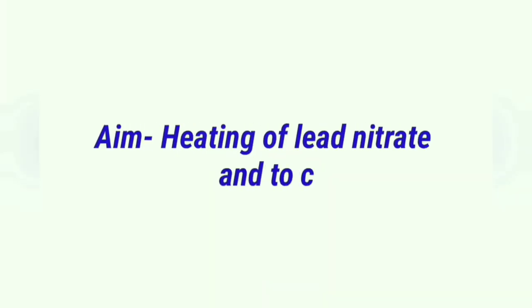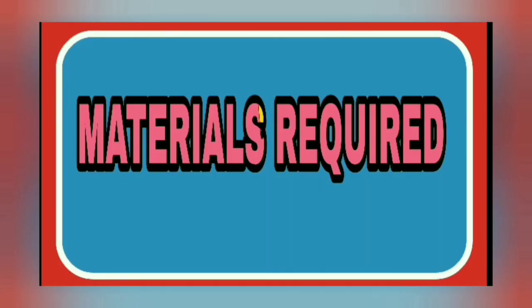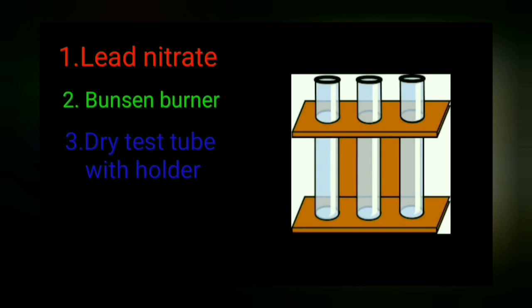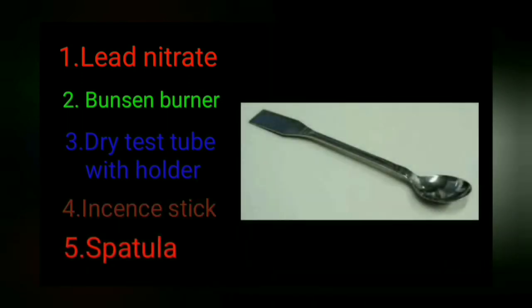Heating of lead nitrate, and we will classify the type of reaction. Materials required for this activity: white crystalline lead nitrate, Bunsen burner, dry test tube with holder, incense stick, and one spatula. Now let's do the activity.